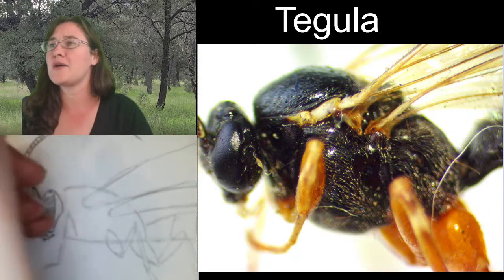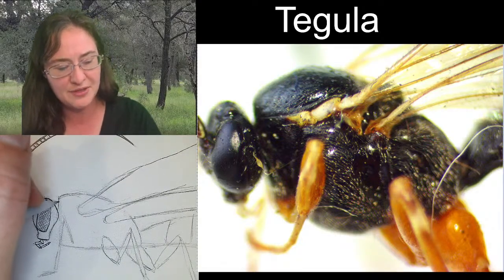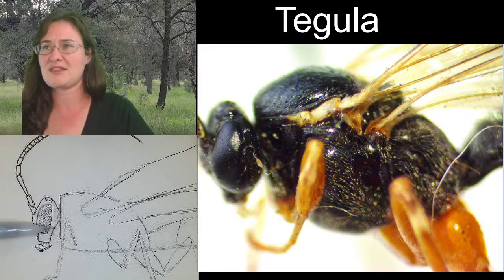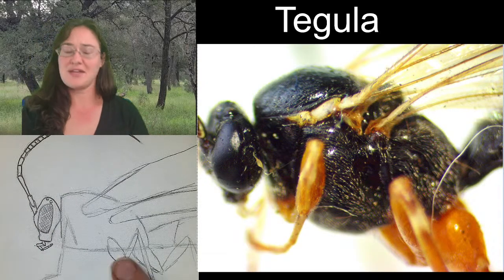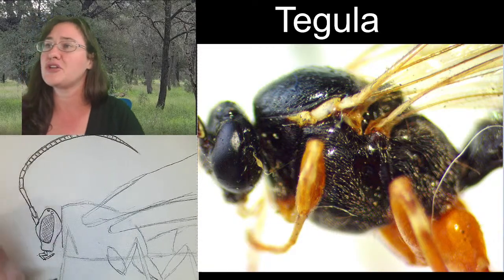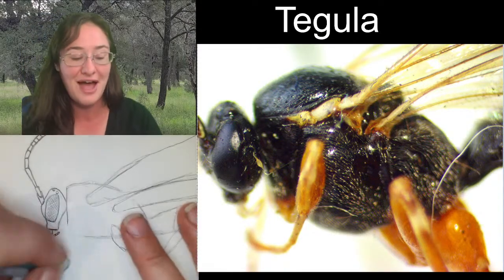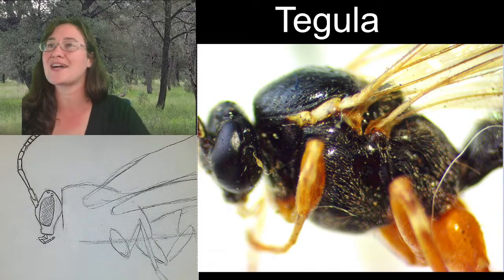So, when we are sketching our thorax, where I want to start is I do want to make sure that this line up here in the front is fairly strong, and even when we zoom in, we can see that that is a fairly vertical straight line. But I'm not going to take it as far down as I did because I do want it to kind of angle in a little bit. Also, I want to have a separation for my coxa in the front, for my procoxa is what we would call it. The first coxa is the procoxa.